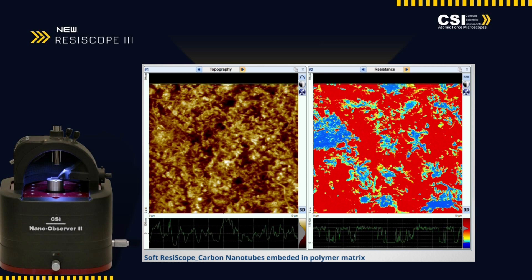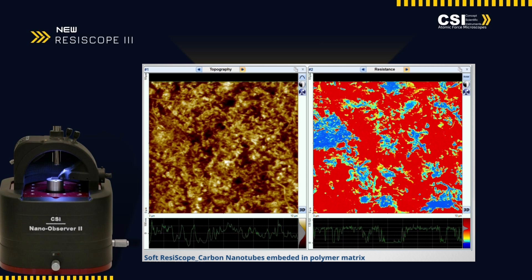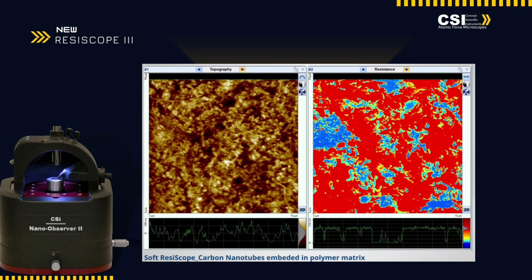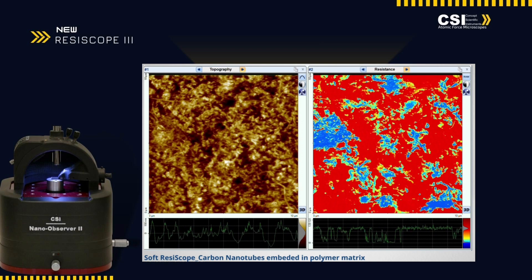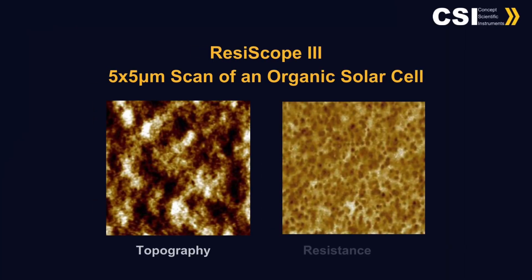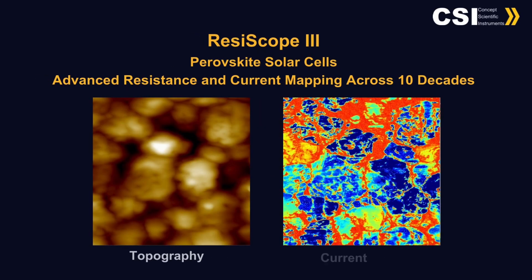The Resoscope's robust design and sophisticated software integration make it an invaluable tool for researchers seeking to push the boundaries of nanotechnology and electrical characterization.